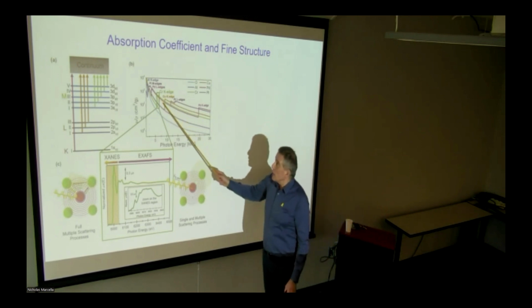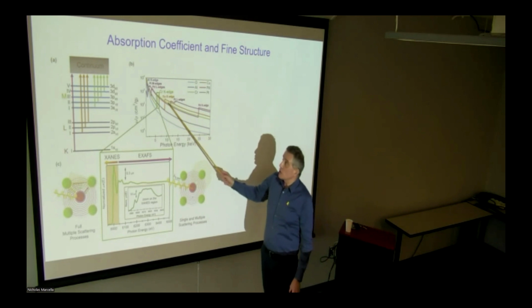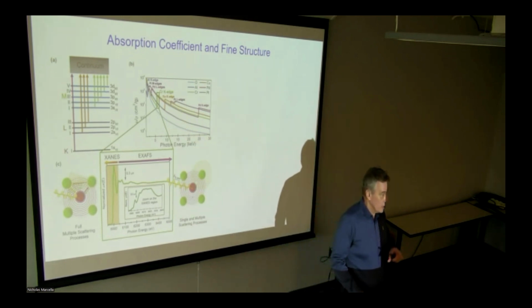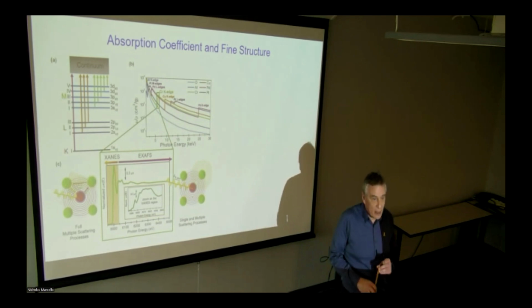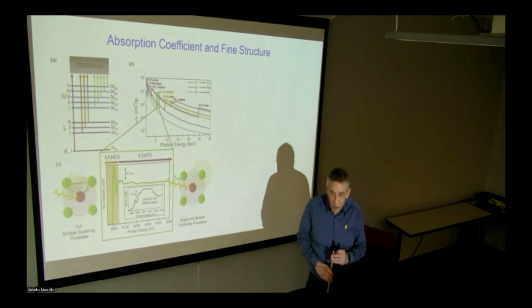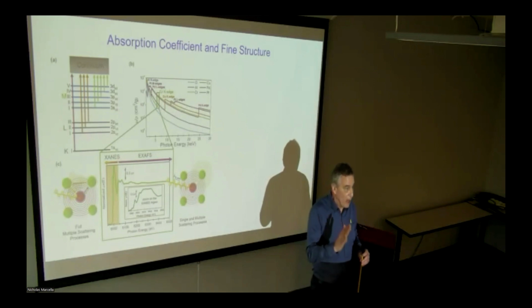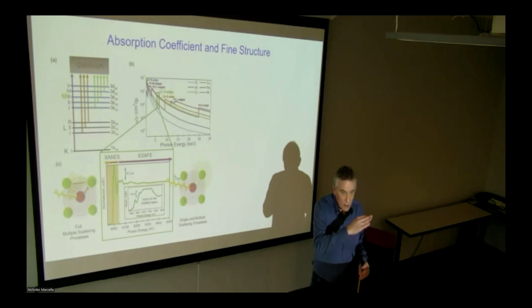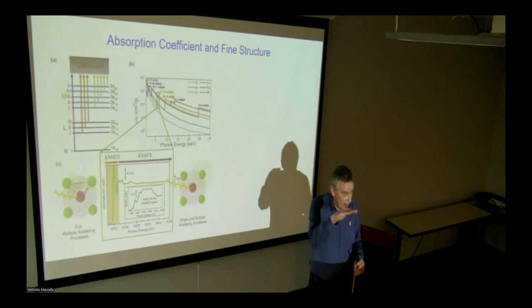And what is not shown here is that there is a fine structure past the absorption edge, and also in the vicinity of the absorption. You will not immediately understand where this fine structure would come from, because the primary effect is binary. Either the electron is absorbed or not. So either the absorption coefficient is low or high. Below the ionization energy it will be low, above it will be high.